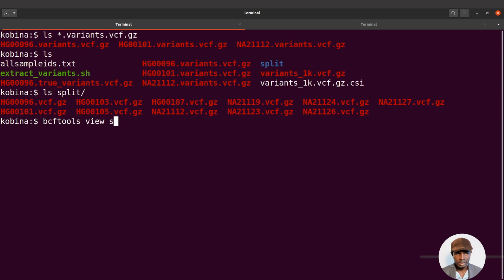I'll specify split/ and then I'll specify the VCF file. I bring my grep -v -c, and I bring my pattern.